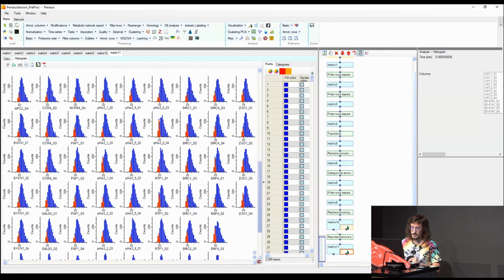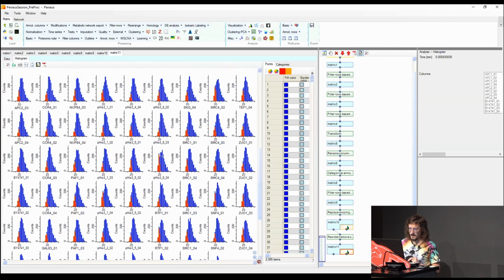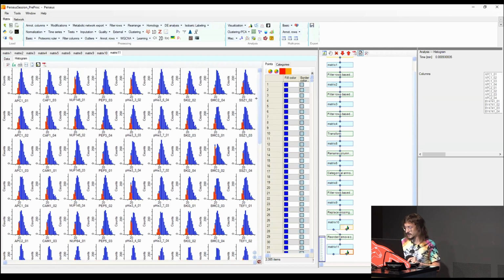It seems so, yes. So, of course, as you can see, there are also some other weird histograms here. That is up to you. If you don't like very much how the distribution is there and you want to have something more robust, then you may also remove them too. But I think we can continue with the statistics here with this data set.